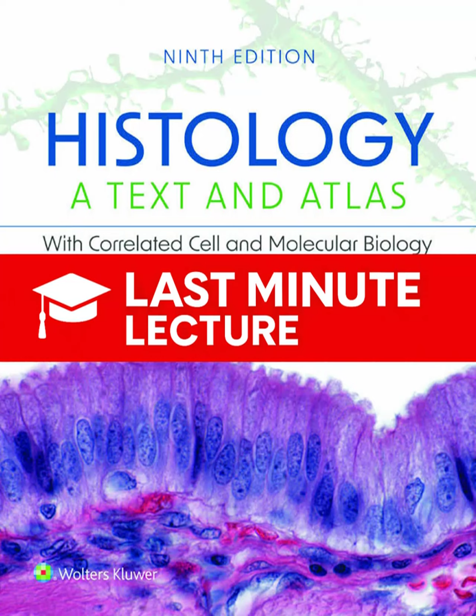Now let's talk about autoradiography. It's an older technique, but it's still fundamentally powerful for tracing dynamic cellular processes, like synthesis. It's an indispensable method for tracking where and when macromolecules are being made. The whole mechanism relies on introducing a small molecular precursor, say radioactive thymidine for DNA synthesis, or radioactive leucine for protein synthesis. So you're tagging the building blocks.